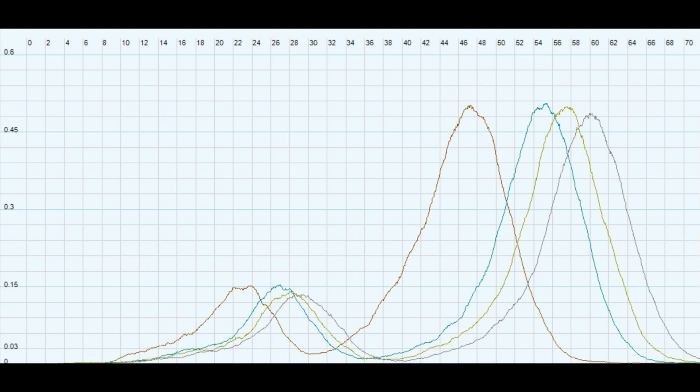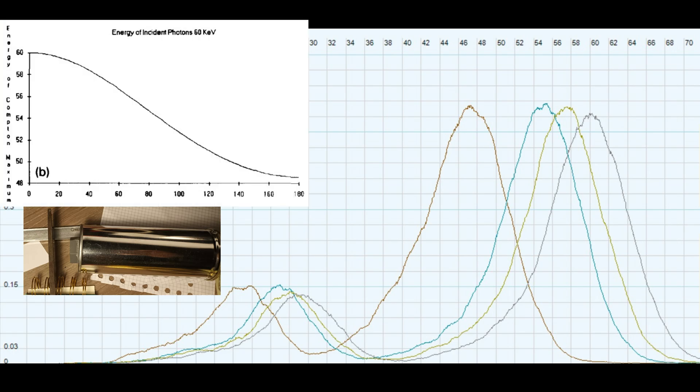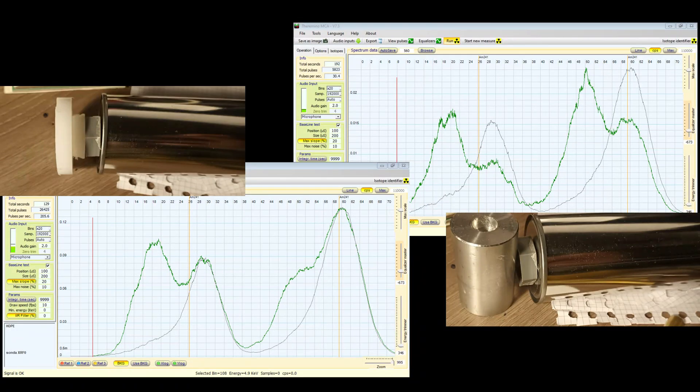These graphs are the backscattered spectrum of the same material which is this metal file I had laying around. The brown line is the maximum recorded Compton shift that is around 12 keV from the main peak at 60 keV while the other colored peaks have been achieved by changing the geometrical parameters. The experimental data fit well with the theoretical one because as you can see from this graph of the possible Compton shift versus the angle, you can see that the maximum achievable Compton shift is almost exactly the same I have achieved between the gray peak which is the background radiation from the excitation source and the brown one which is the maximum Compton shift. These two are other examples of Compton scattering with lighter elements.